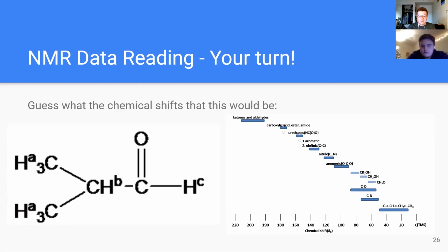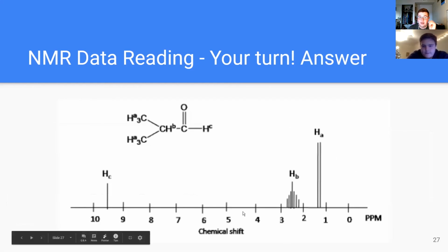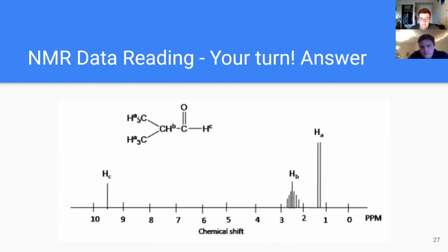And welcome back. So looking at it, it would be broken up again into the A, B, and C sections. Both of these groups are the same from their connection to what functional group they are, so you can see that they're included here together. There's 1 hydrogen, N+1, 2 lines.